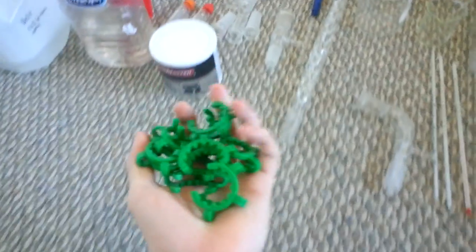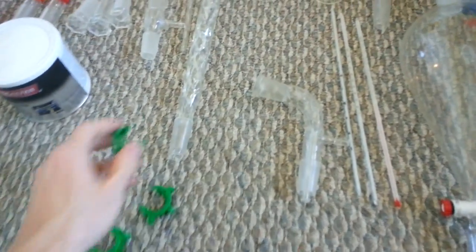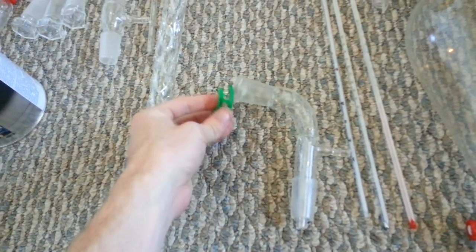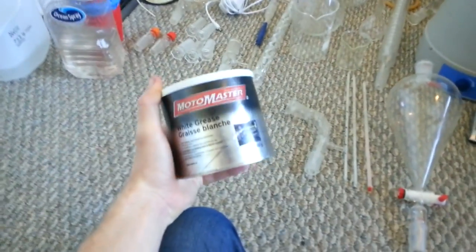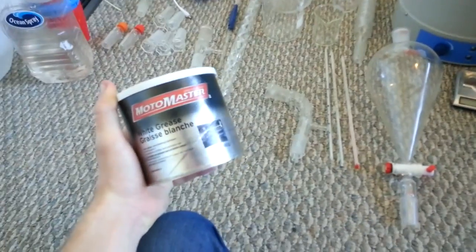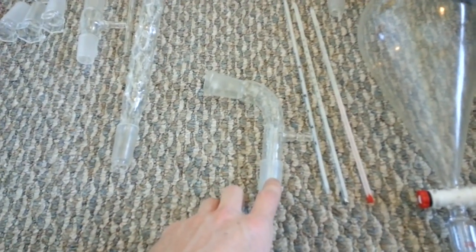You should get some of these clips — they're little plastic clips. They're like $3 or something like that for 10 of them, and what they do is they go onto the glass joints in order to keep glass joints together. Very useful to have. Get some grease — this is automotive grease, white grease. You can get silicone grease or something like that. They're used for greasing up the glass joints. If you don't grease them up before you put them together, they'll get stuck, and that's really bad because sometimes you cannot get them apart.